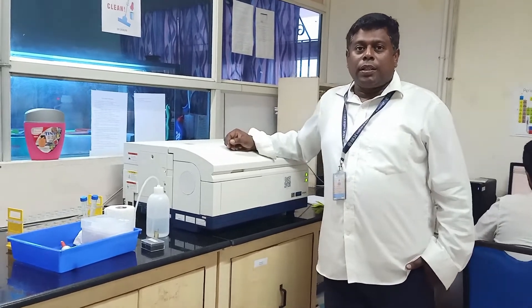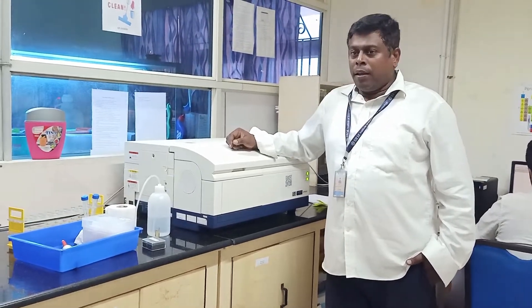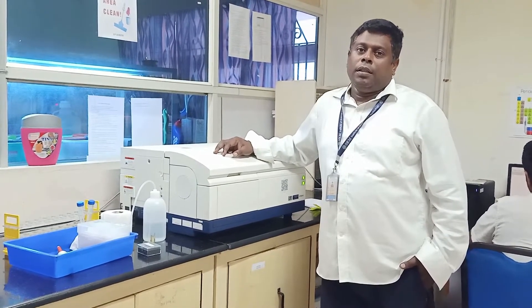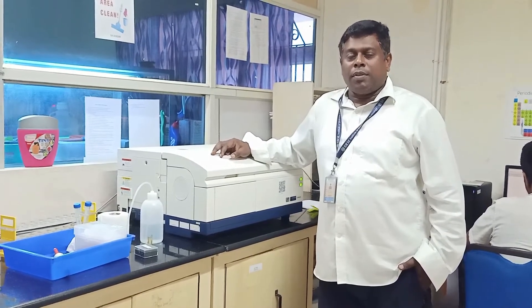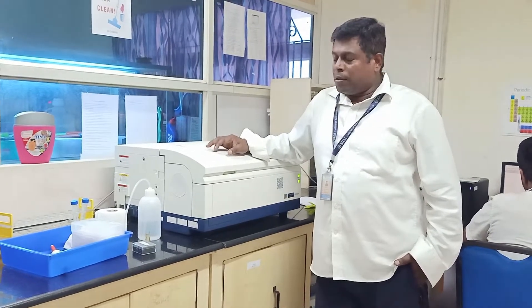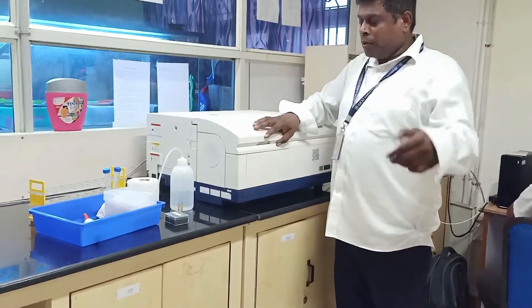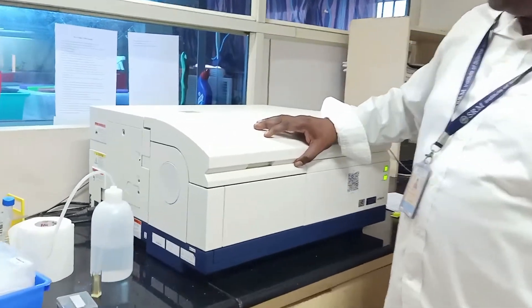This instrument allows you to scan the fluorescence at emission as well as excitation modes. If you come closer, I will show you how the instrument looks.